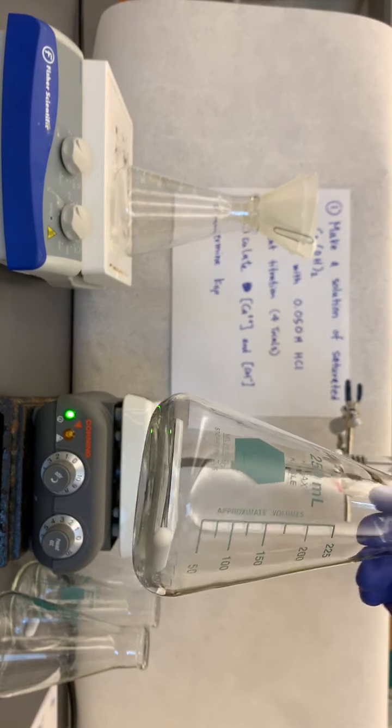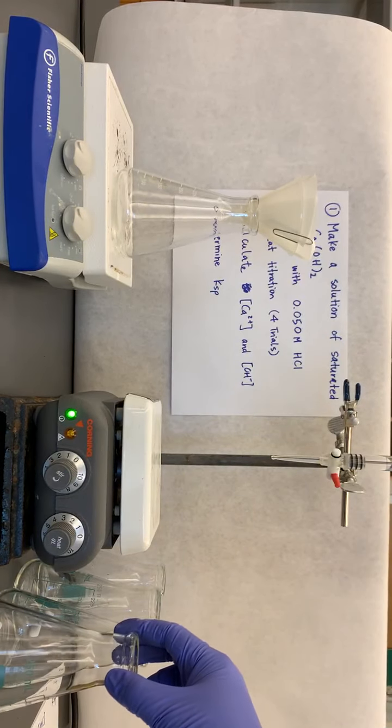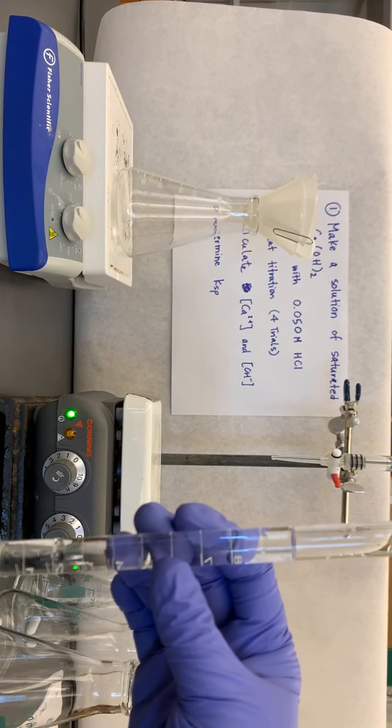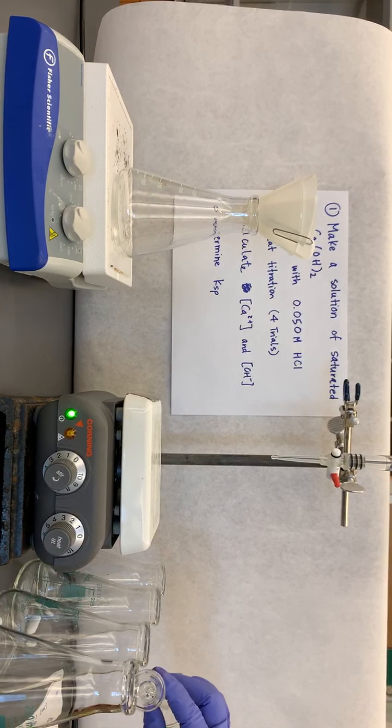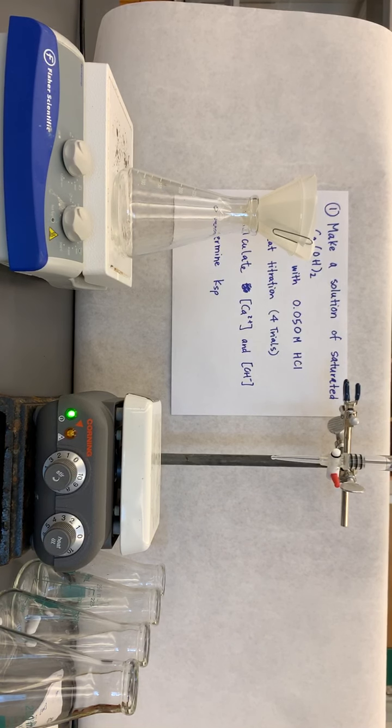Meanwhile, what I'm going to do is I've got here 4 Erlenmeyer flasks with a stir bar inside, and I have 4 of them because I need to titrate it 4 times. Okay, so to each of the Erlenmeyer flasks, I'm going to go ahead and add my 10 mils of water. Okay, so I've got 10 mils of water here in my graduated cylinder. Just going to add 10 mils here, and I'm going to do that 3 more times.